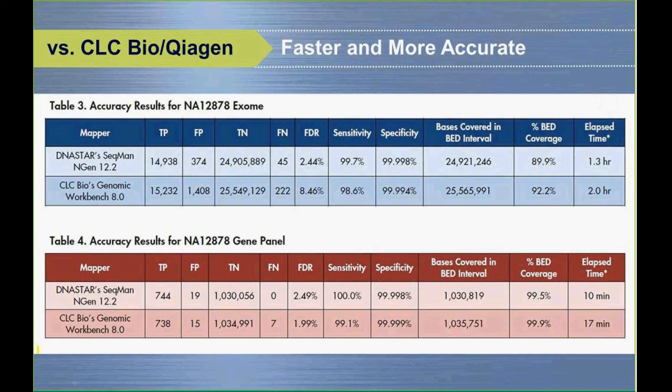Another relatively new piece of functionality is the human variant annotation database. And you'll see that when we set up our assembly projects, we're able to pull in database information. This variant annotation database comes from all different sources. There are functional predictions from SIFT, PolyPhen, and MutationTaster, and conservation scores, and ClinVar clinical information, and then also genotype and allele frequencies from 1,000 Genomes, and of course dbSNP. We bundle it all together and automate pulling this information into your analyses. And so the new software, this version 14, has streamlined these workflows so that we can do these different analyses and pull in database information.